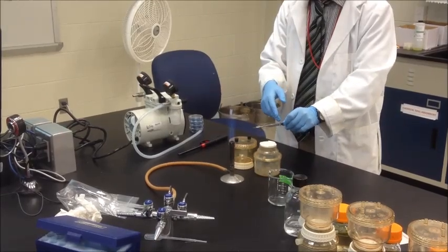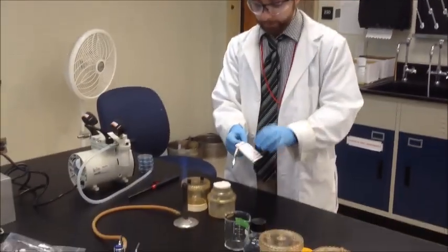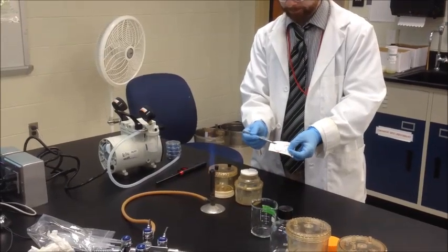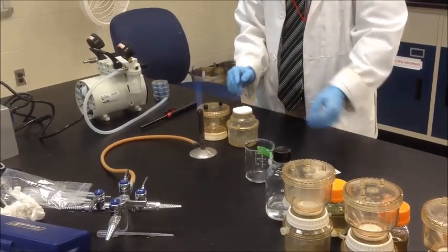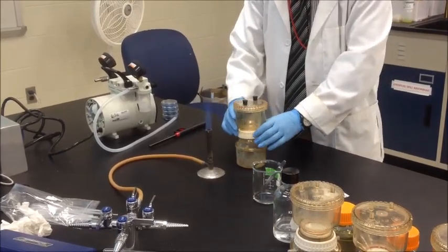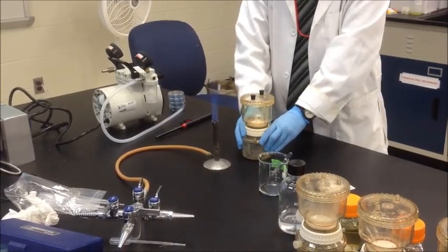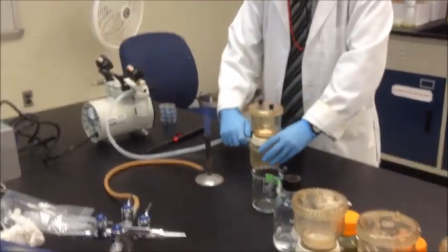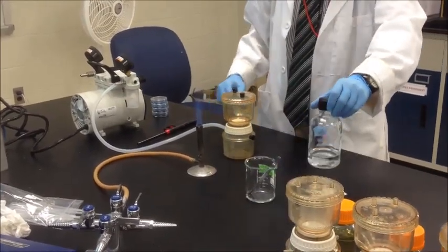Once the flame has gone out and I let it cool for a second, I will then take my membrane. I unwrap my membrane, and with the forceps, place it on top of the catchment chamber. The forceps can go back in the ethanol, and I will now screw on the chimney as such. Next thing I'm going to do is take my vacuum and plug it in to my chamber here.